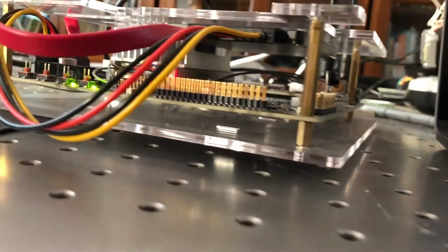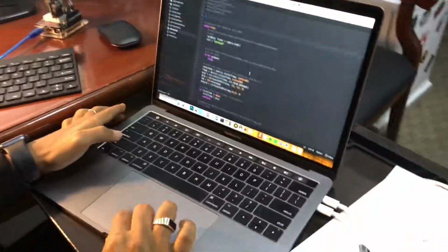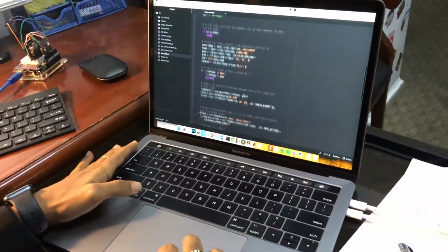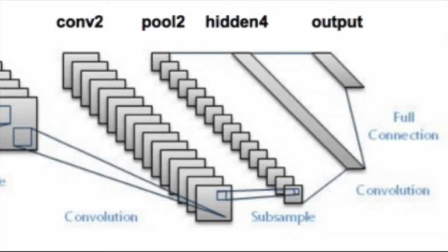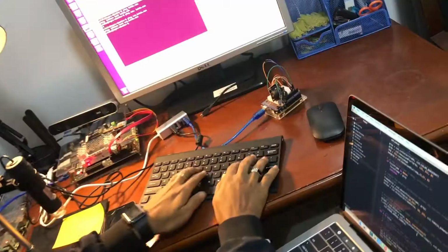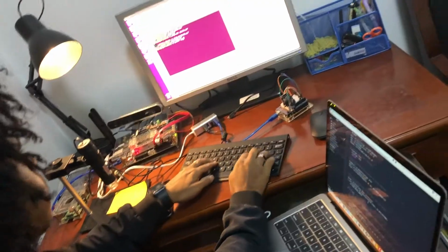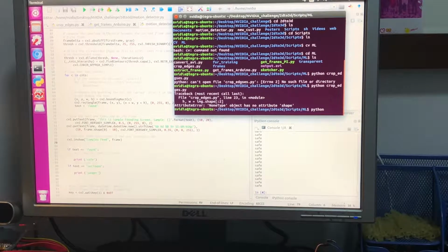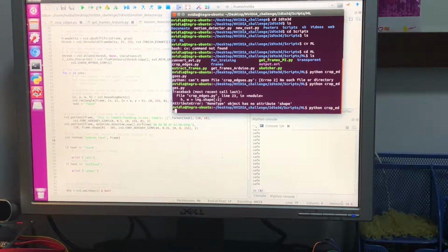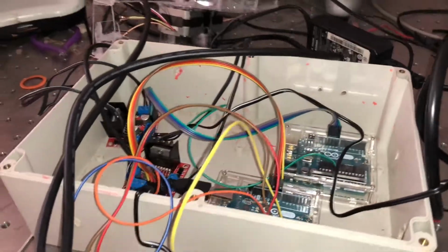We've made an intelligent device to detect microstructures from a microscope. We have developed a neural network algorithm on our Jetson TX2 supercomputer. We have integrated computer vision to see objects, and we use other hardware like Arduinos and motors to control the microscope knobs.